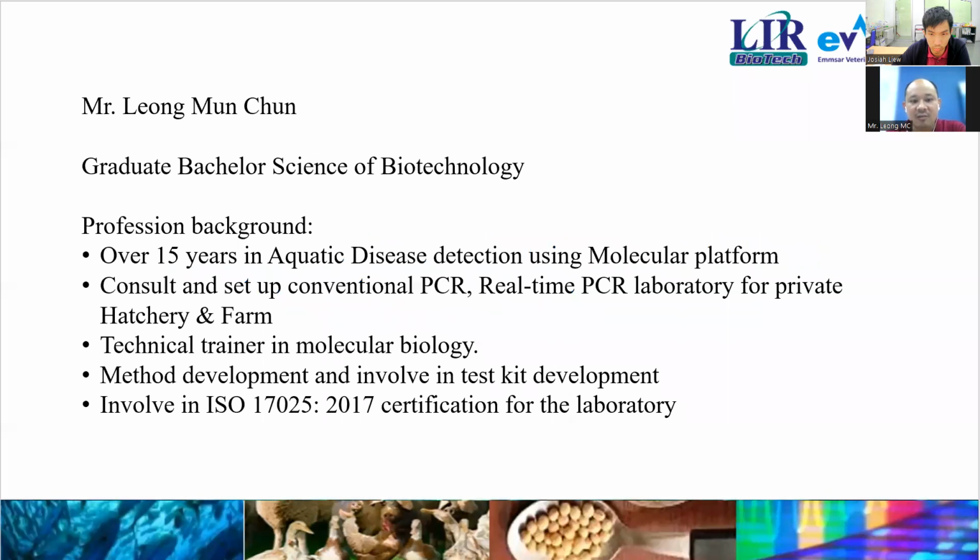I've been in aquatic disease detection for over 15 years, and I've consulted in setting up conventional PCR and real-time PCR labs for private hatcheries and farms. I'm also a technical trainer in molecular biology, and following the demand from our customers and clients, we were involved in developing PCR and molecular detection test kits to support customer needs, and also in ISO 17025 certification.